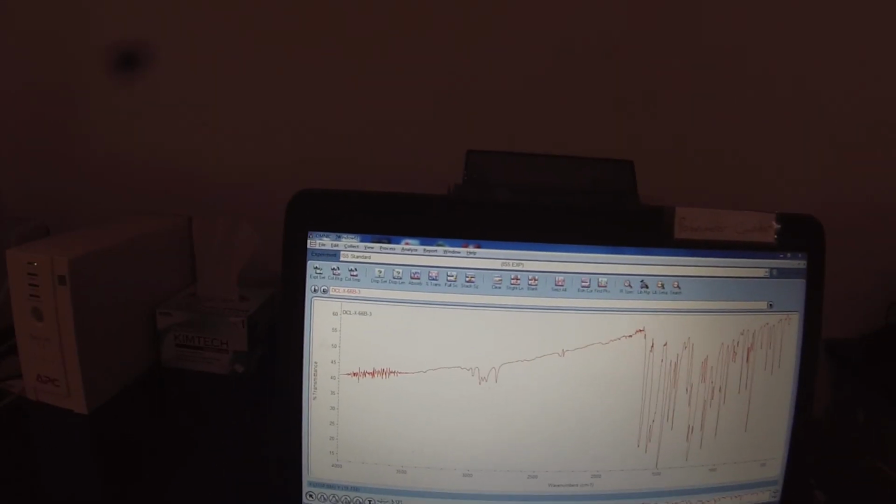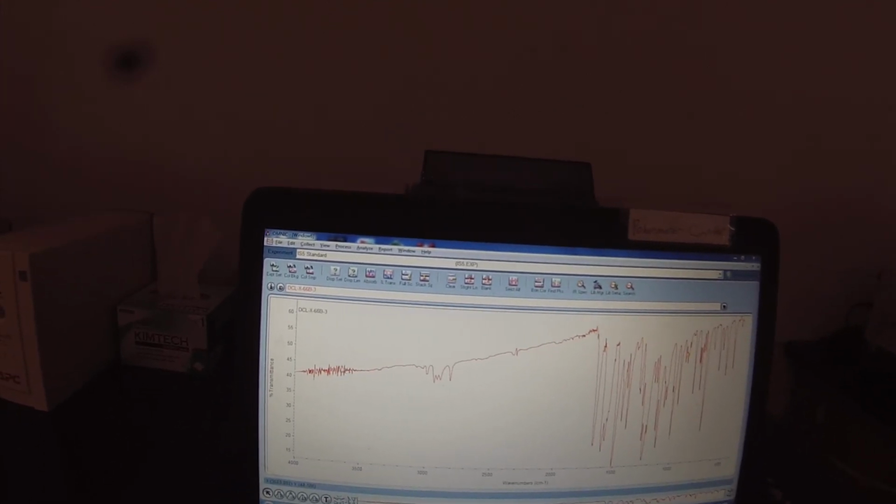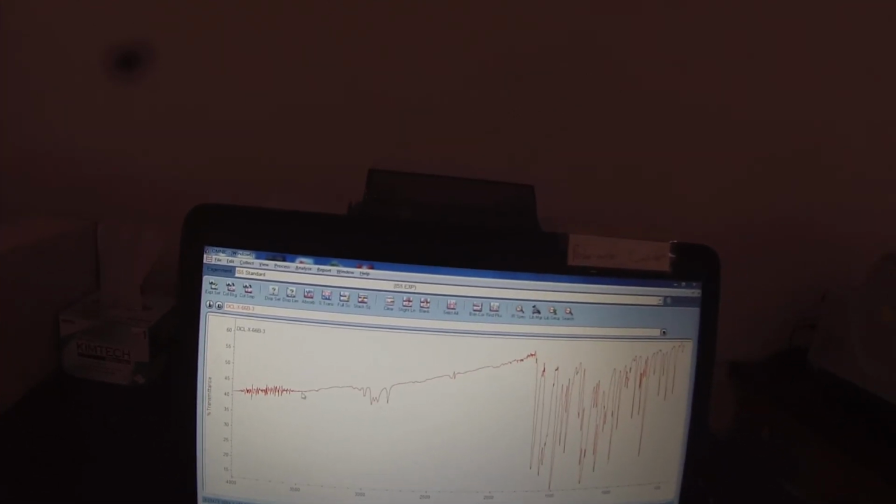So it looks pretty good. We've got 15% transmittance, nothing is pegging at the bottom. Definitely got some water vapor, but that's normal. So let's save that file. File name to title.